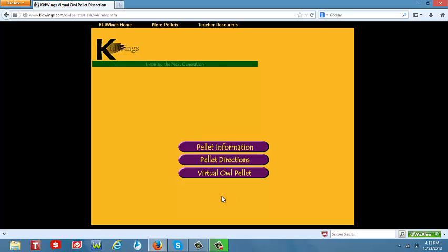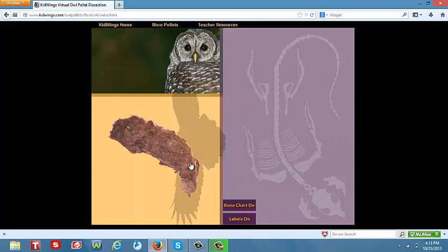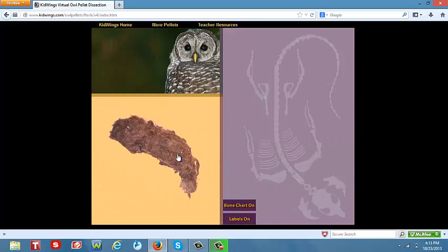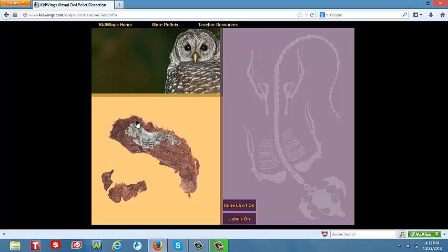Once students are ready to dissect, they may click on the virtual owl pellet. This will bring them to their virtual pellet that they may begin to dissect. To begin, they will click on it and remove the fur from the owl pellet.